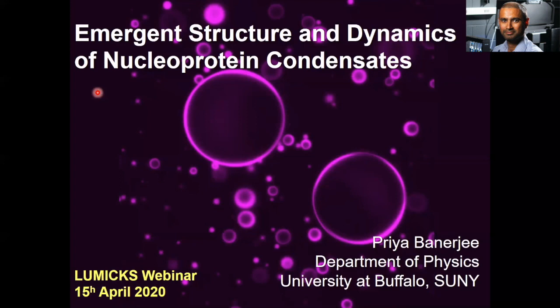One of the defining features of today's seminar is that we will be talking about how correlative fluorescence and force microscopy could be utilized to study emergent structure and dynamics of these condensates, which are believed to be present in many cellular organelles.